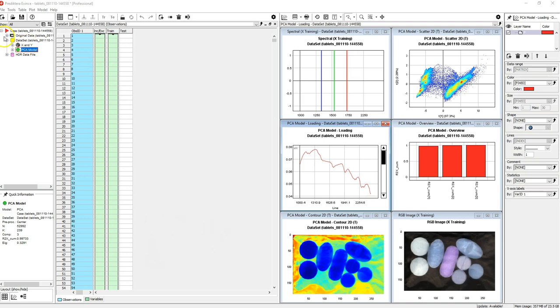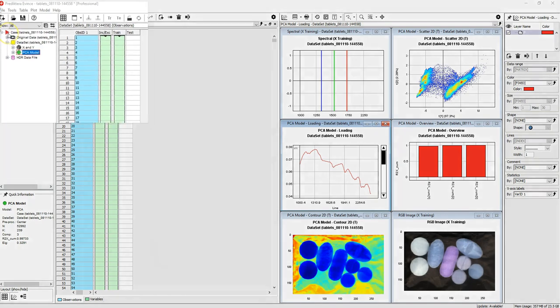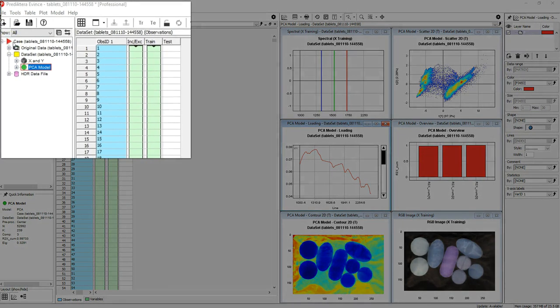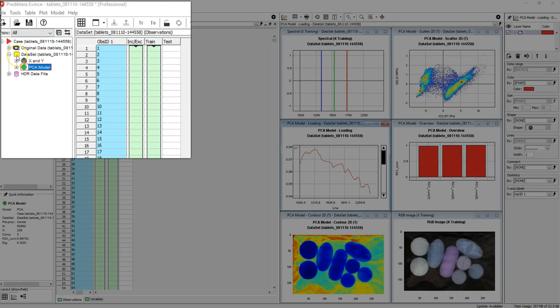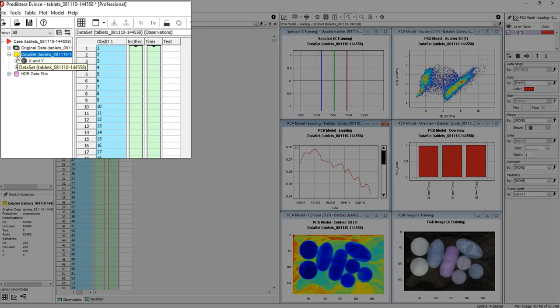On the left hand side we have the data tree. This shows you an overview of the hierarchy of datasets and models that are in your project. The dataset with this yellow square is a work copy of your original data, which you can modify in your EVINS project.